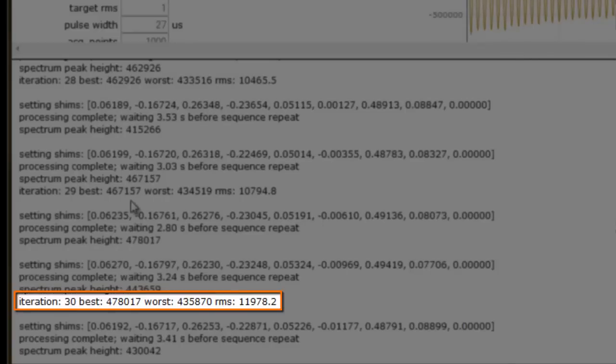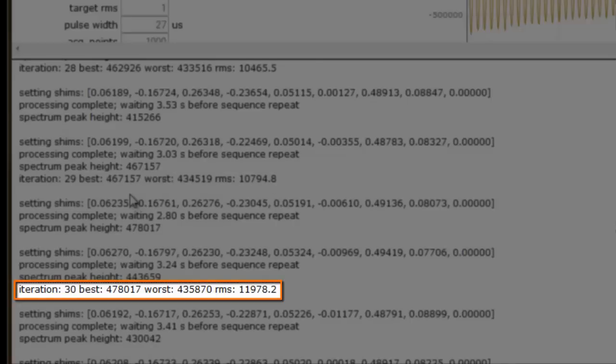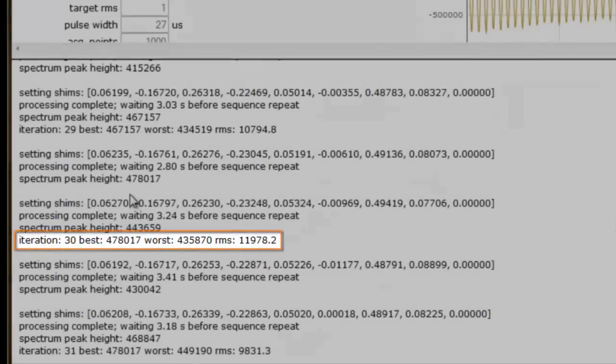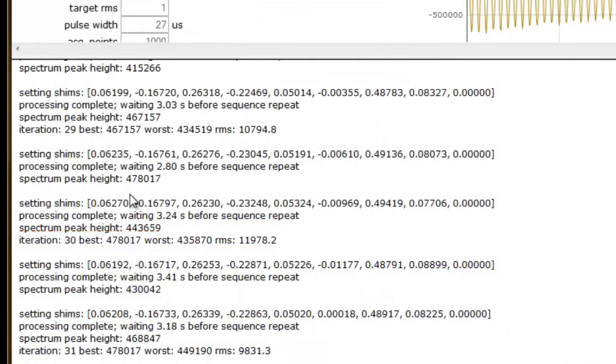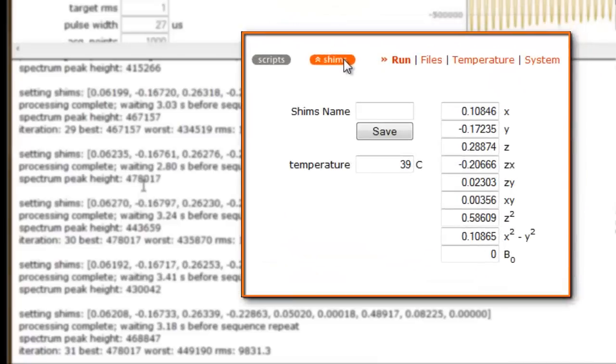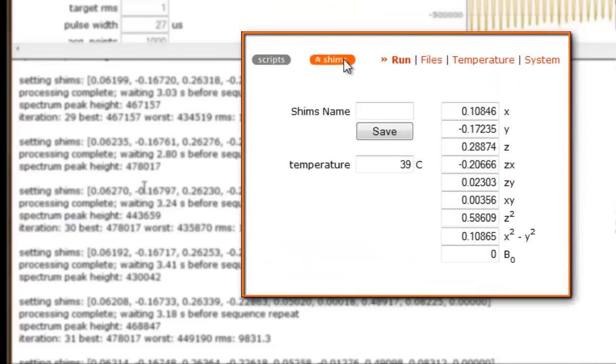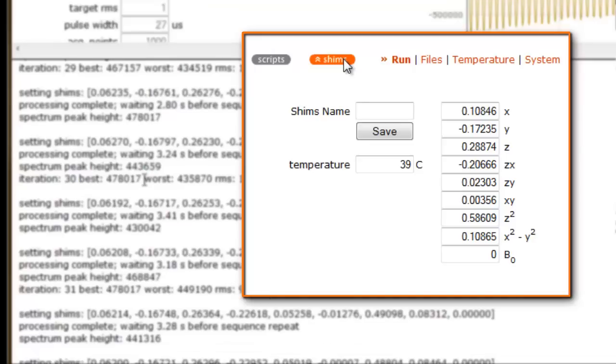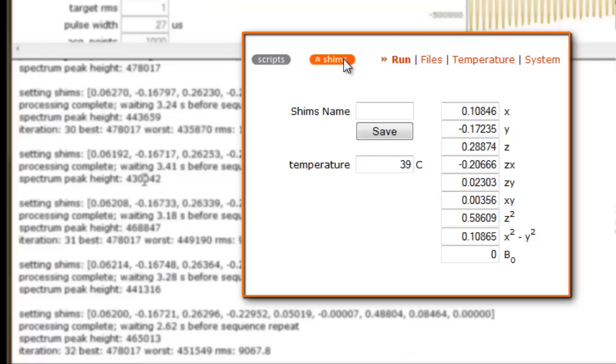If we choose to abort the script right now, the best values obtained so far would be written to the shim electronics. The shim parameter user interface field would open up, and the new, optimized values would replace the old shim values. It is important to note that the shim values will only be overwritten if an improvement has been made during execution of the AutoShim script, or if one manually adjusts the shim values and executes the AutoShim script.